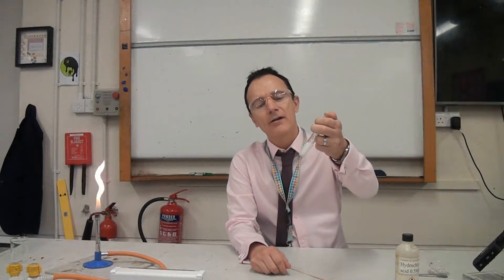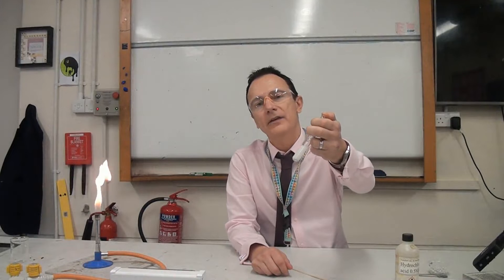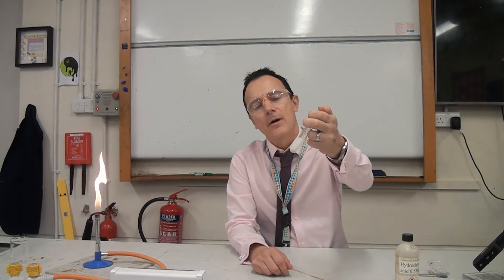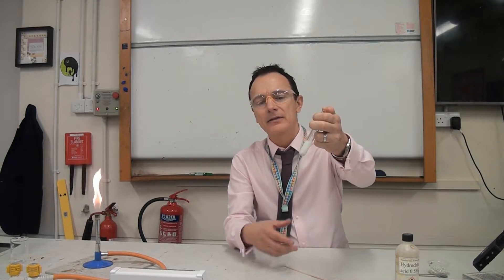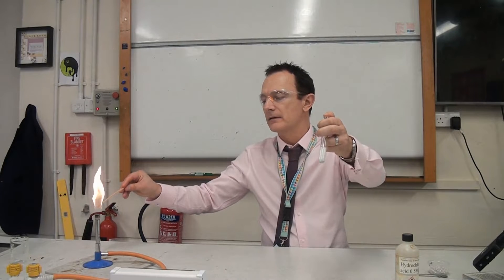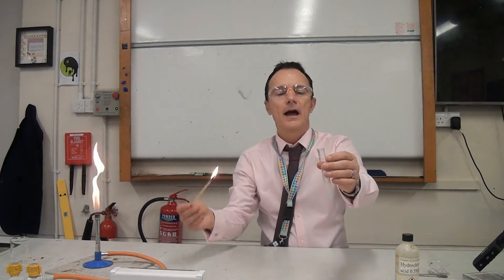In here I've got some hydrochloric acid and some pieces of magnesium, and you can probably see it fizzing away quite furiously. I'm going to test what that gas might be. I've got a lit splint and I'm going to put it at the mouth of the test tube — and that squeaky pop sound tells us that it's hydrogen gas being produced.